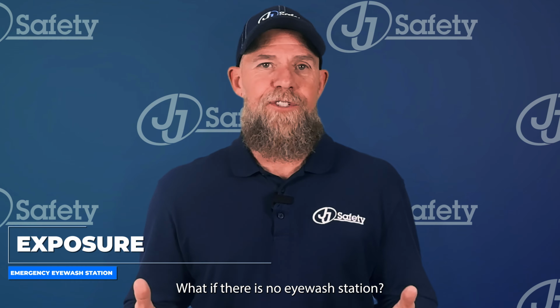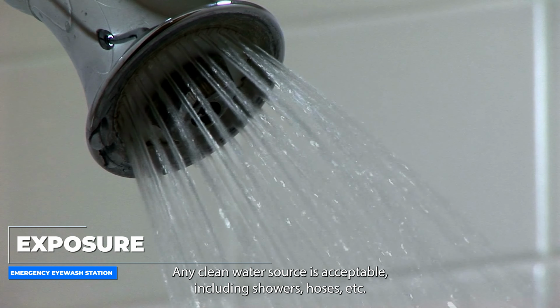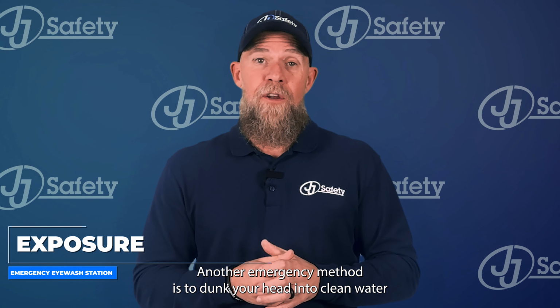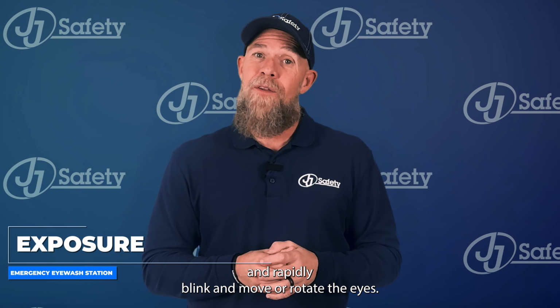What if there's no eyewash station? Any clean water source is acceptable, including showers, hoses, etc. Another emergency method is to dunk your head into clean water and rapidly blink and move or rotate the eyes.